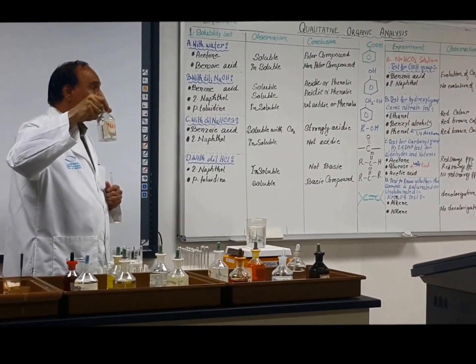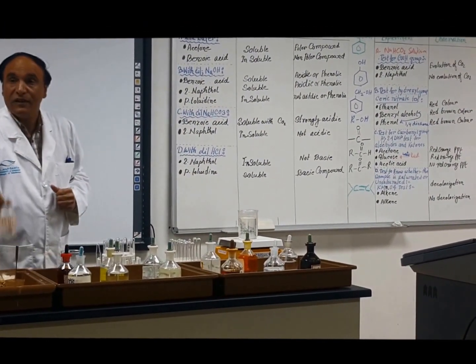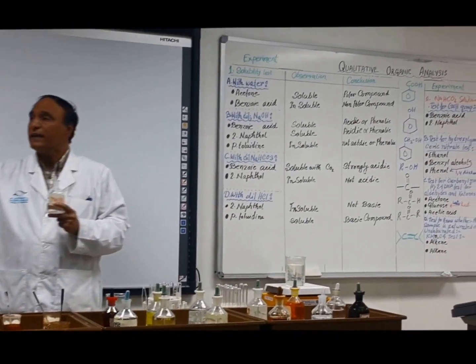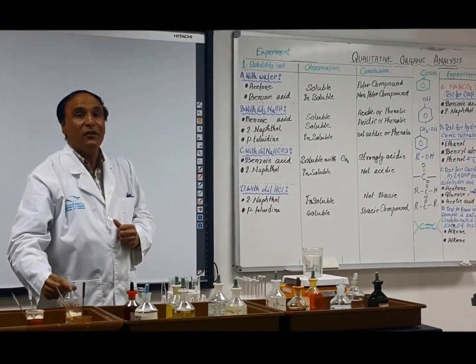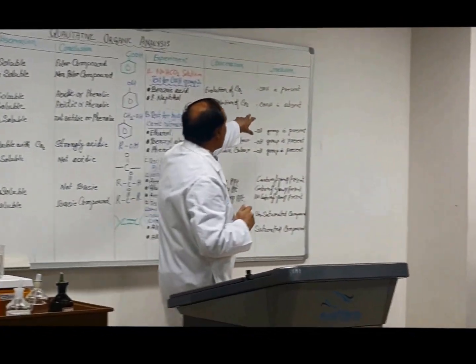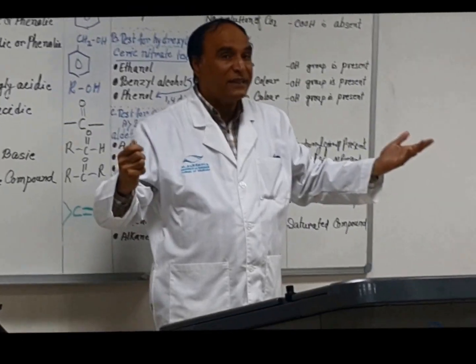Is hydrochloric acid organic or inorganic? Inorganic. It will give a test. Any acid, organic or inorganic, will give the same test. But today what we are doing? Organic. So that's why I have written over here carboxylic acid is present, because carboxylic acid is an acid, so it will give.